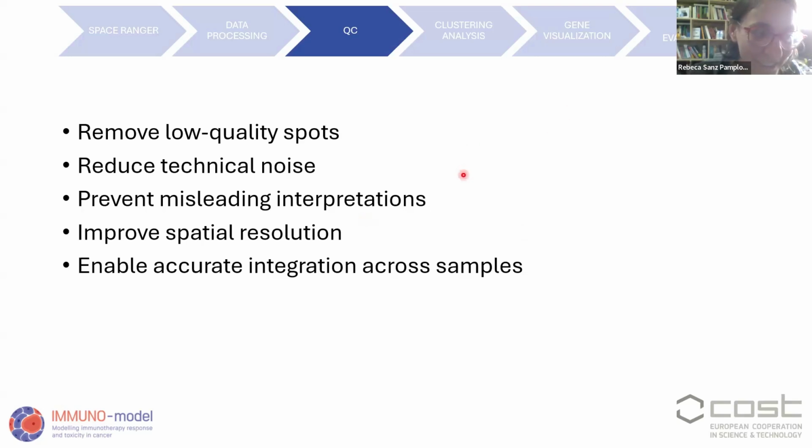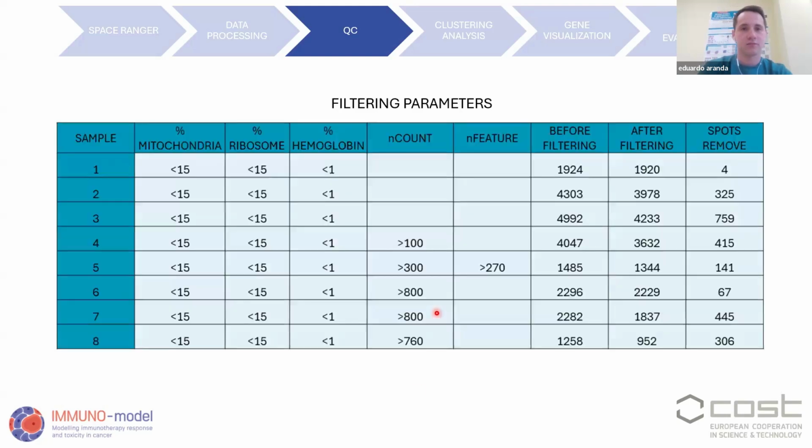Thank you. For example, this could be important if you want to analyze multiple samples, and with this you can remove and minimize the batch effects. Okay, now I continue.